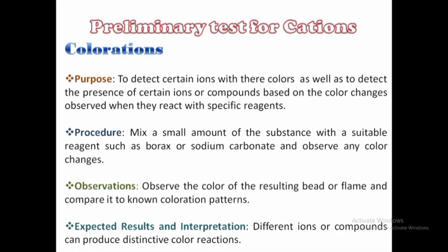In the coloration test, first you detect the color of the ions. Some ions are colored while some are not. Some, in the presence of certain ions or when they are heated, produce certain colors.